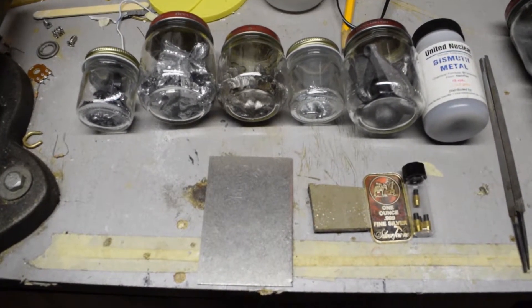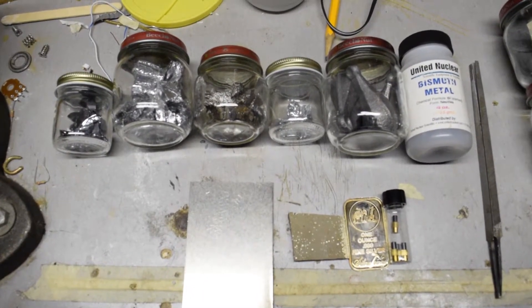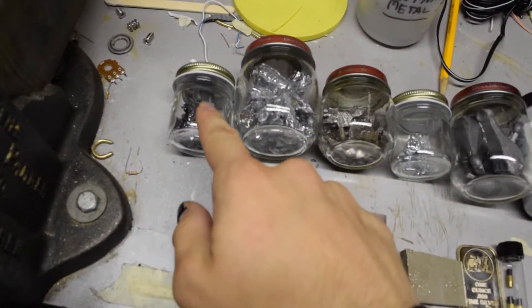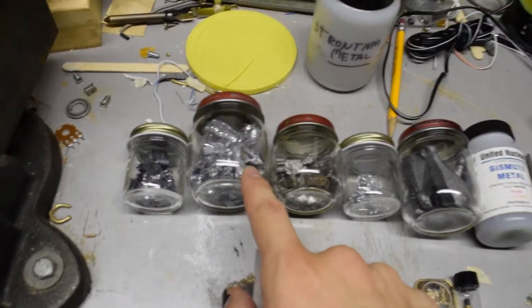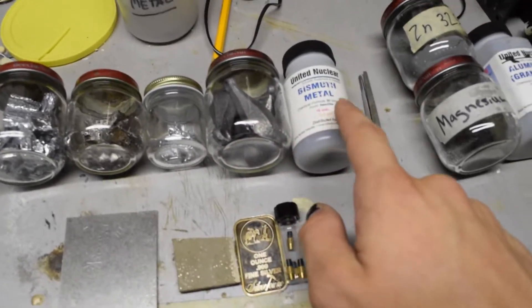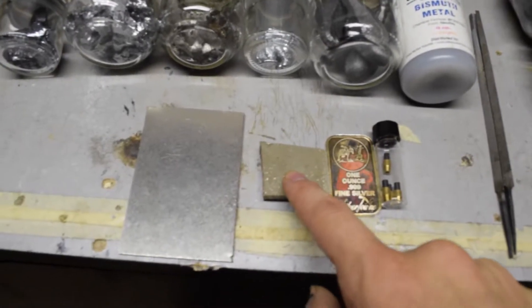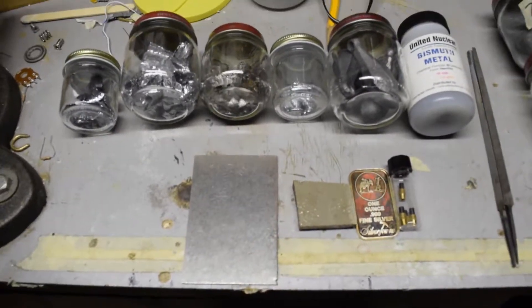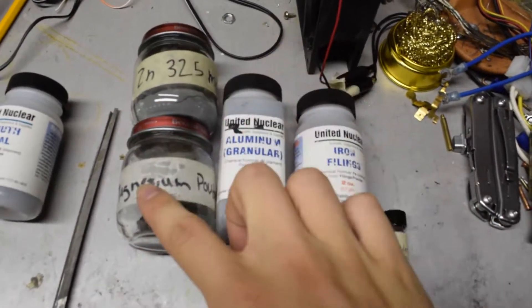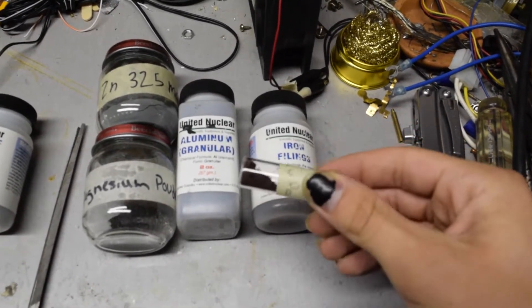Right now, the metals that you're seeing in front of you are mostly elements, and I'm going to use a file to powder them. Right here I have silicon, which is not actually metal, chromium, manganese, gallium, lead, bismuth. Here's a ferrocerium alloy, here's silver, cobalt, nickel, and I already have these metals that are pre-powdered: zinc, magnesium, aluminum, iron, and some copper that I powdered electrolytically.